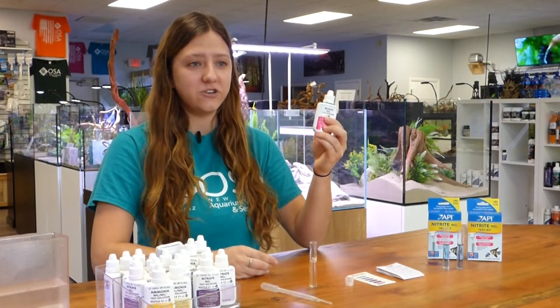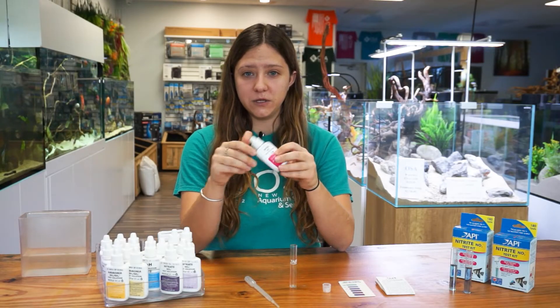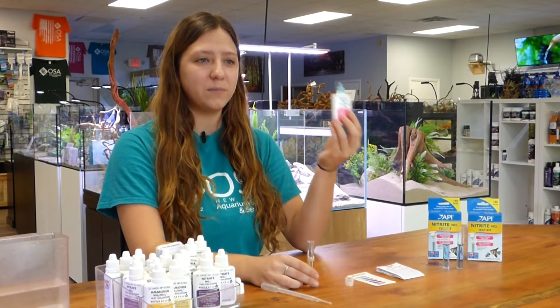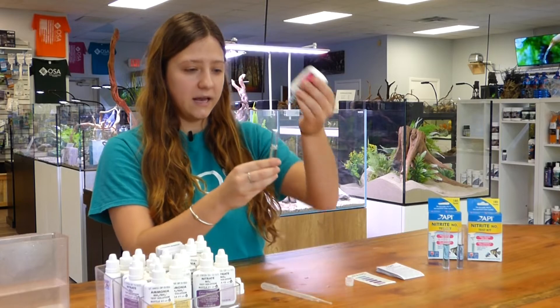Next you're going to take your nitrite test bottle, and you are going to add five drops into your test tube. Make sure you hold your bottle completely upside down to ensure that you have uniformity in drop size, and add five drops.